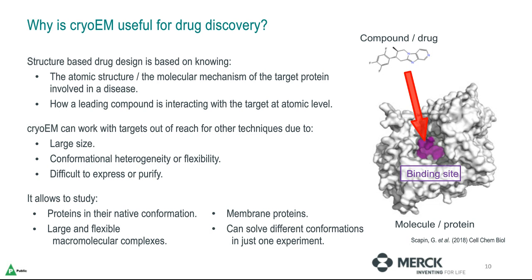studying some targets that have been out of reach for these 2 techniques because of their size, conformation and heterogeneity, or flexibility, or because they are very difficult to express or purify, and therefore they are produced in very small quantities. This technique, CryoEM, besides that, offers the possibility to study the proteins in their native state, and also of working with membrane proteins, specimens that are usually complicated to solve by other techniques, but that constitute the targets for over 50% of all modern medicinal drugs.